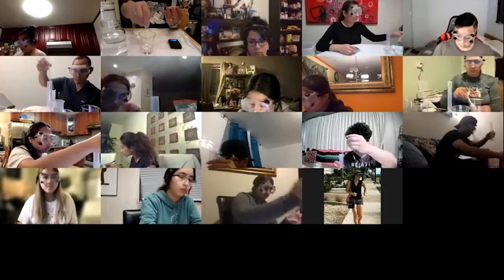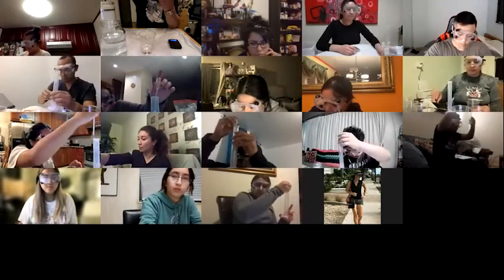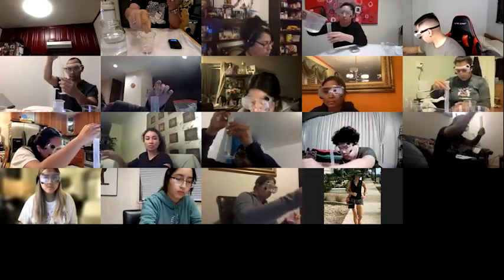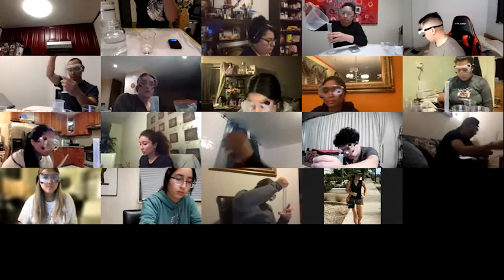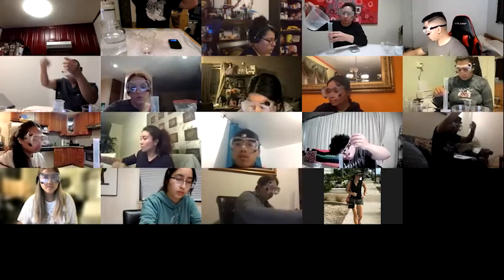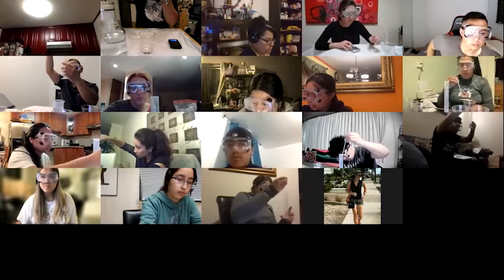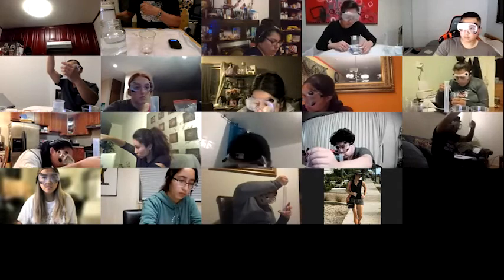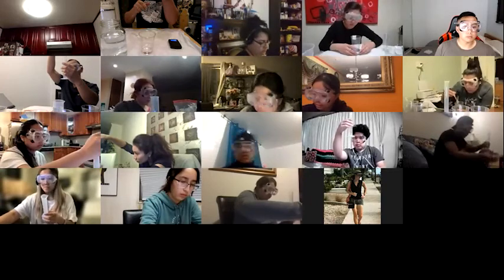And again, you have to keep it parallel with your eyes so you can see the 5 mL better. If you have some liquid that's stuck to the side, just give it a tap to get it all down there.